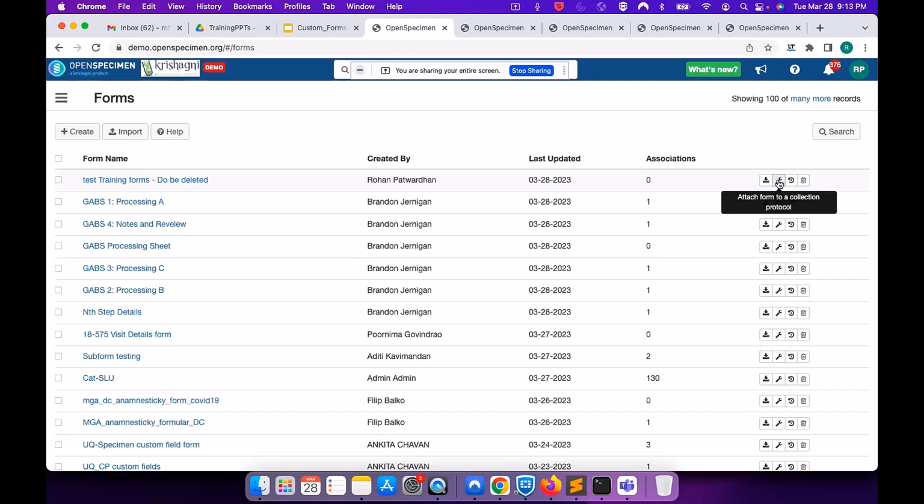And then I had seen something about a way to enable HTML markup for forms. Are you able to show where that is able to be configured? What do you mean by XML markup? HTML markup. Okay. What was the purpose of doing that? For better formatting, so that it's easier to read the form. Yeah, so I can draw people's attention to different pieces of it and space things out better.